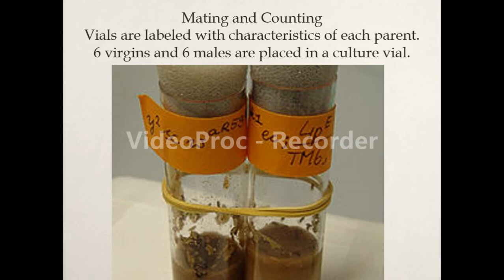So the parents, 6 males and 6 females, are present in the culture, we understand. You must note it. First of all, you take bottles, take fruit flies and place them in the vessels containing the chemical and the culture, with 5 grams of yeast plus an equal volume of water.